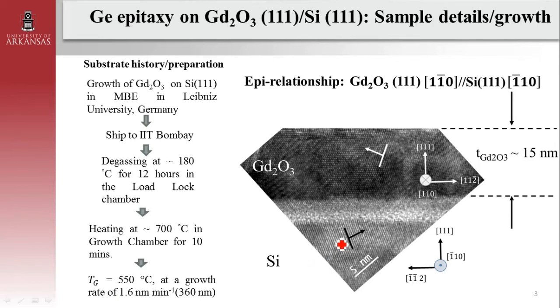So the normal to the 1 bar plane is indicated by an arrow here. All right. So here, if you rotate the interface of the two layers, let's say like this, if you consider the interface of the two layers as a mirror plane, you can superimpose one arrow with the other.